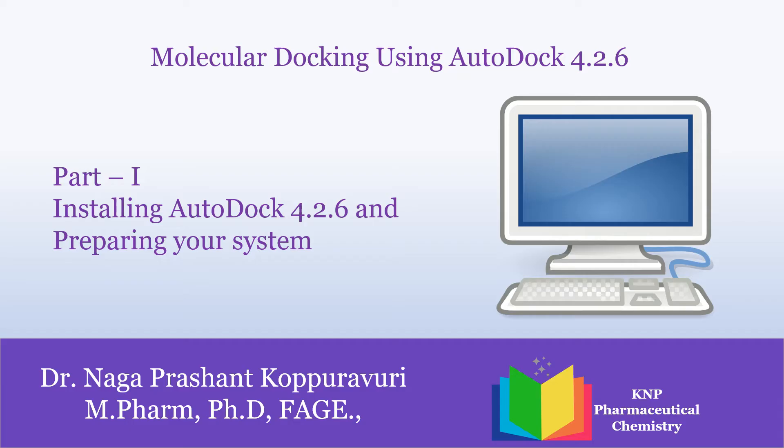In our part 1, I am going to discuss how to install AutoDock 4.2.6. Before we use AutoDock 4.2.6, we have to prepare our system like we need to copy few files from installation folder and paste them in our final working folder. In this tutorial, that is in part 1, we are going to see all these like installing and preparing our system.